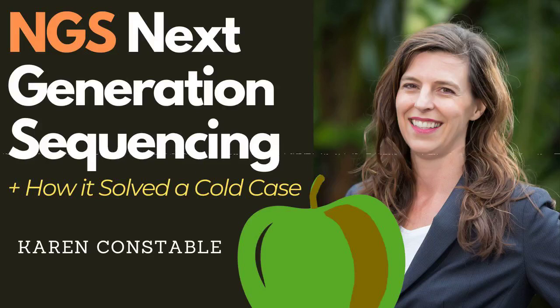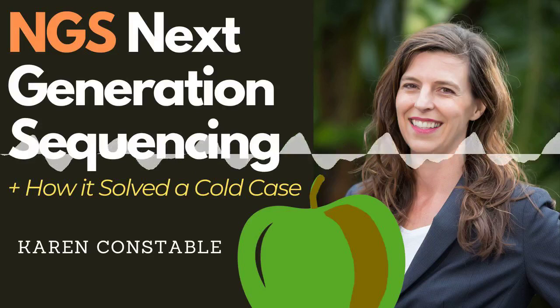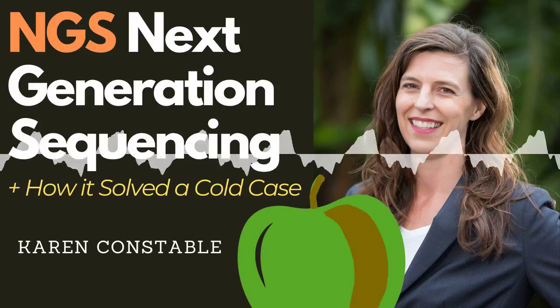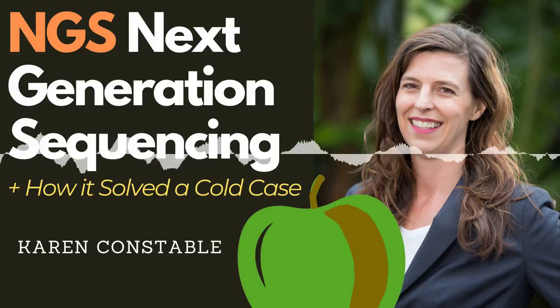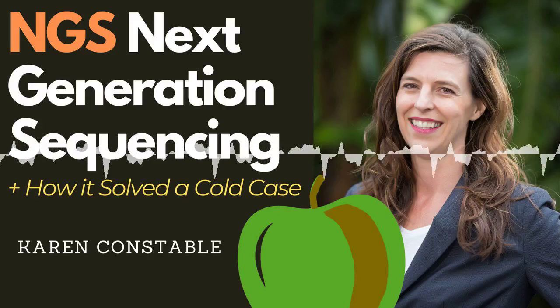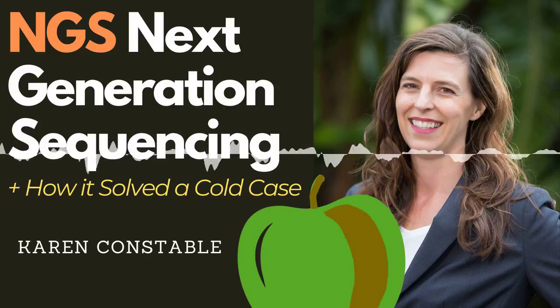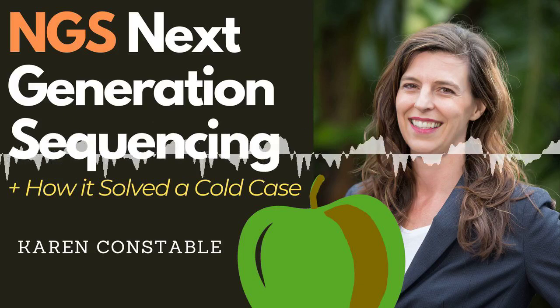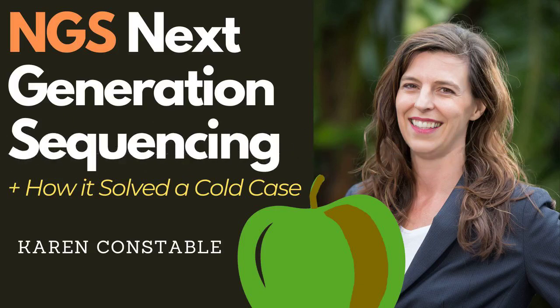Cold case solved, and what you need to know about the newish tool NGS. NGS, Next Generation Sequencing, is a cheaper and faster way to catalogue the entire genome of an animal, plant, or microorganism. Although it's been possible to discover the DNA and RNA sequences of organisms for decades, it used to be prohibitively expensive. NGS methods are much cheaper than older technologies, and this means that it's now practical to use DNA and RNA sequencing to discover which strains of a pathogen are responsible for illnesses.